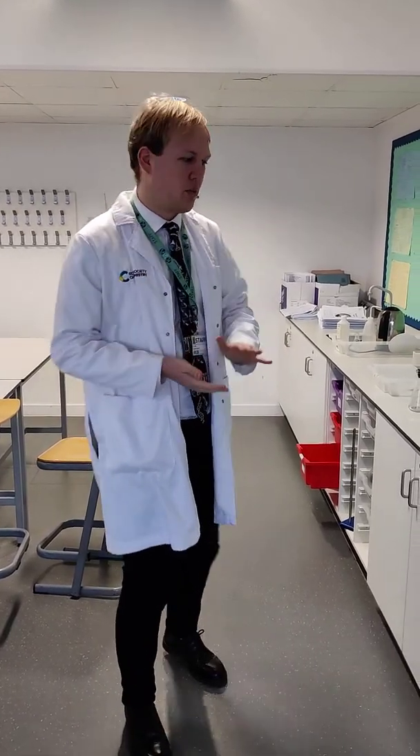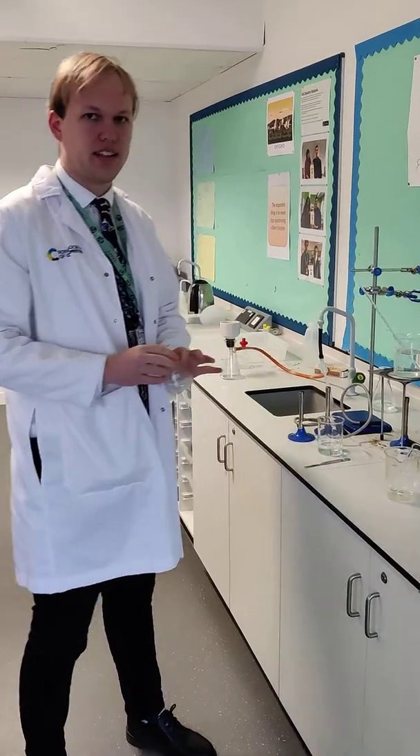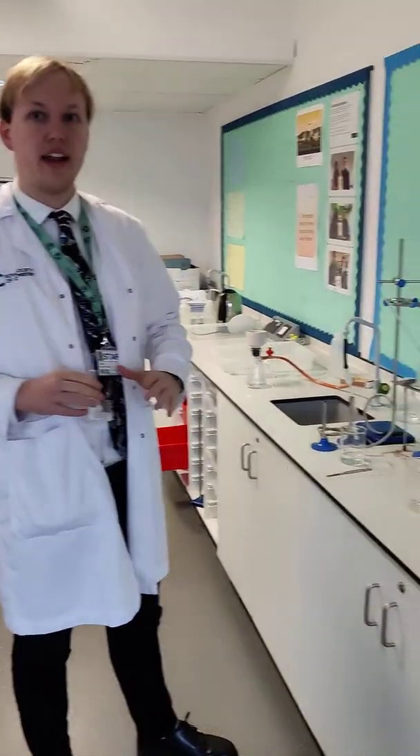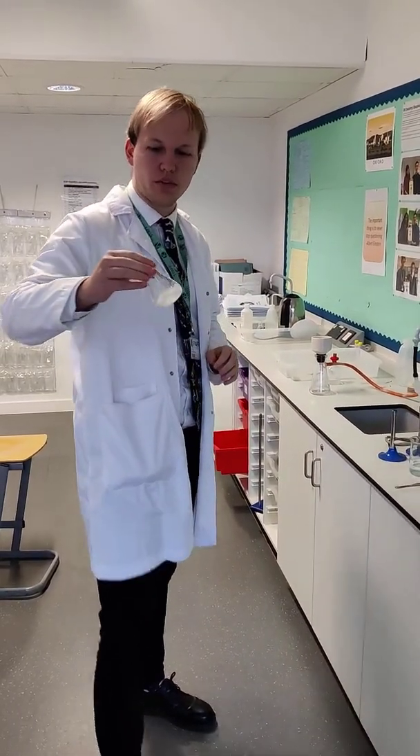We are back with Mr Bell, carrying on with the Quite Practical 10A. So Year 13, we're now back at the reaction and we've left our conical flask to react for 20 minutes in this water bath, and then after we took it off to let it cool down to room temperature, and this is what we've got.